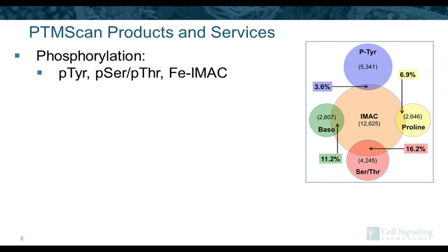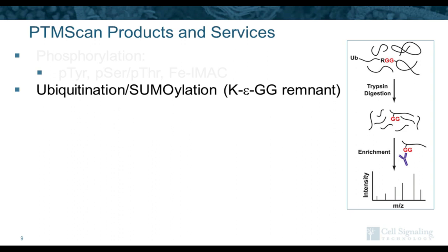One of the interesting things that we've seen and others have seen is that depending on how you enrich, with an antibody or with the metal affinity beads, you actually get different and complementary pools of phosphopeptides identified. And this is particularly important for phosphotyrosine. So to get good coverage of the tyrosine phosphoproteome, you really need to be doing the enrichment using an antibody step.